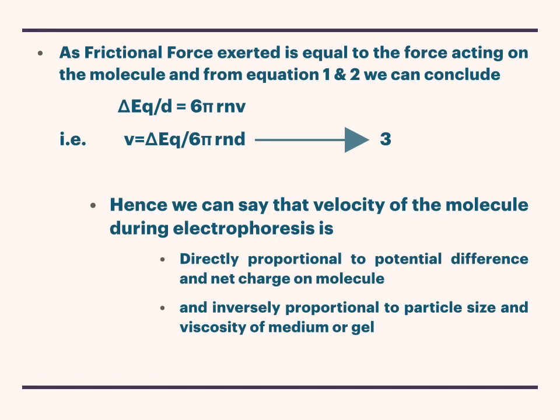And by looking at this equation 3, we can conclude that the velocity of the molecule during electrophoresis is directly proportional to the potential difference and net charge on the molecule, and inversely proportional to the particle size and viscosity of the medium or gel. This is the principle of electrophoresis.